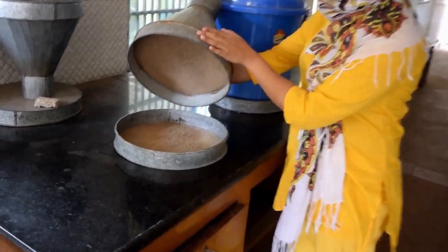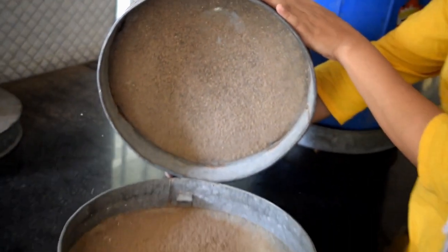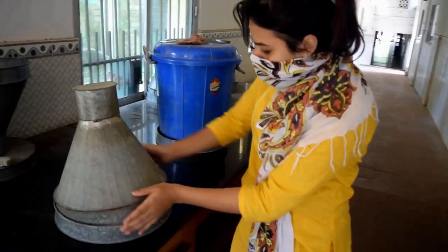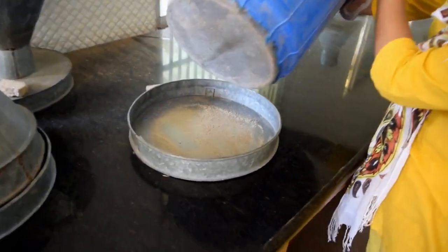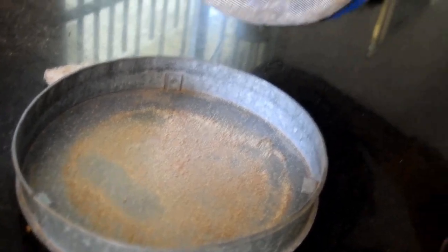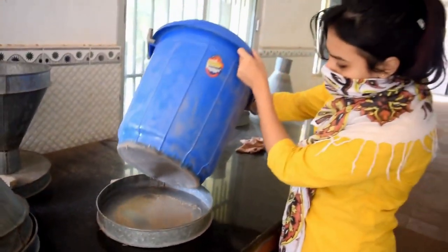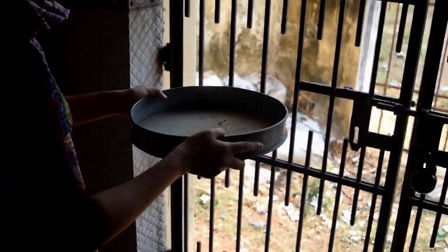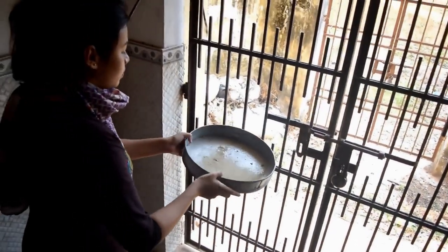Eggs are collected in a tray placed below the oviposition cage. The eggs are contaminated with scales and other broken body parts like legs, mouth parts, antenna, and wings.